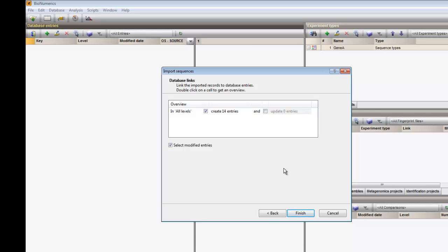The overview dialog tells me that 14 new entries will be created in my database. As I click the Finish button, the import will start.